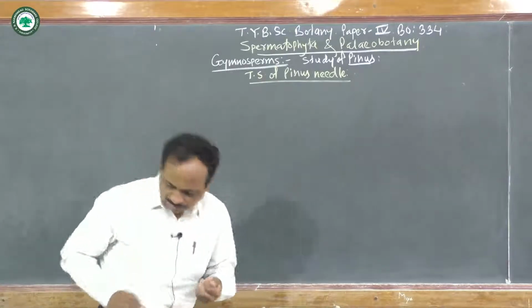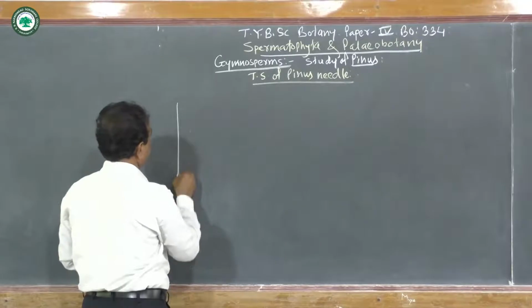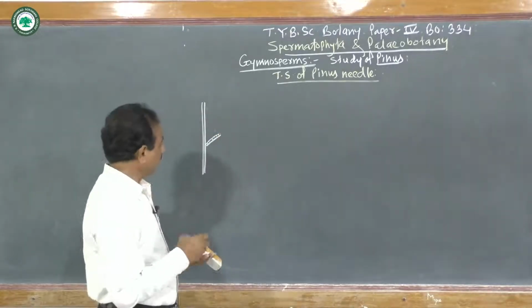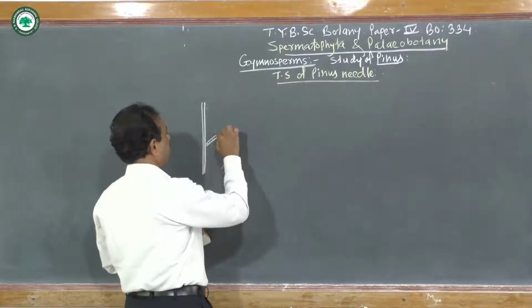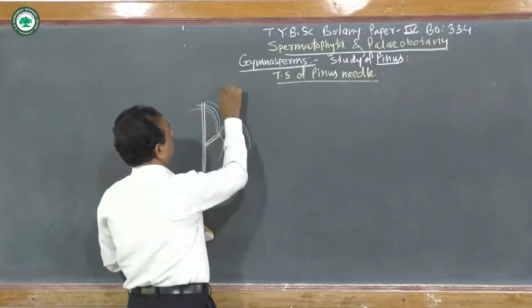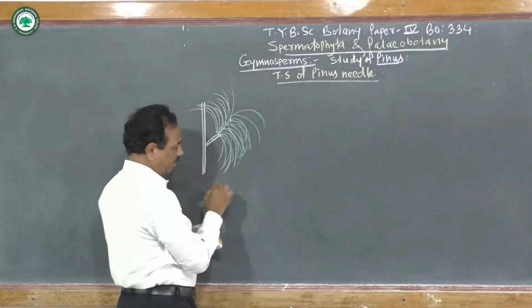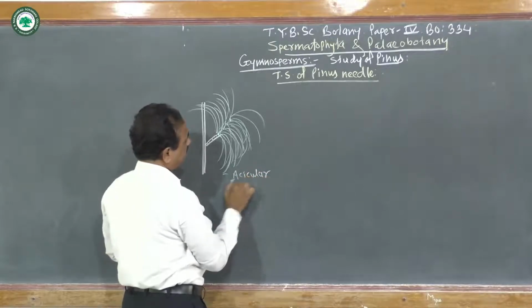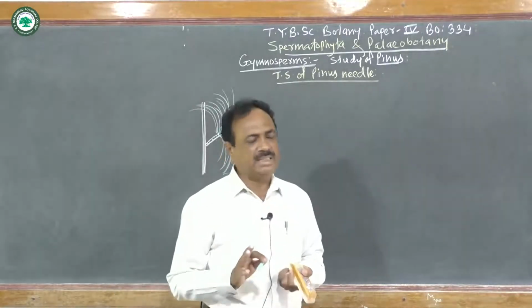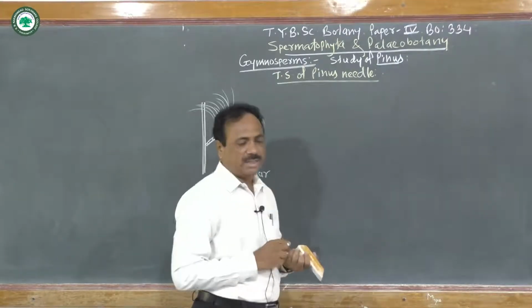So here if we see the Pinus leaves, these leaves of the Pinus are needle-like. They develop on the dwarf shoot, and Pinus shows the presence of needle-like leaves. These leaves are not dorsiventrally flattened, but they are acicular. Such a whorl of leaves is developed, and as these are needle-shaped, they are not dorsiventrally flattened, that is, having a dorsal and ventral side. So they are acicular or needle-like, and that's why they are commonly called the Pinus needle.